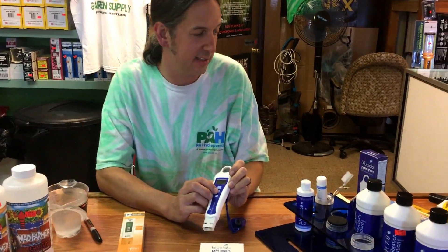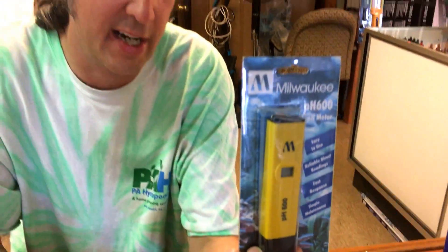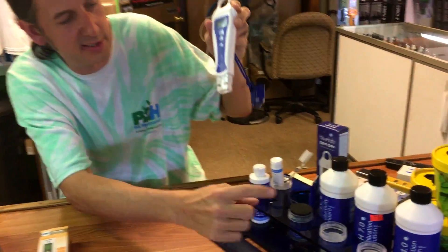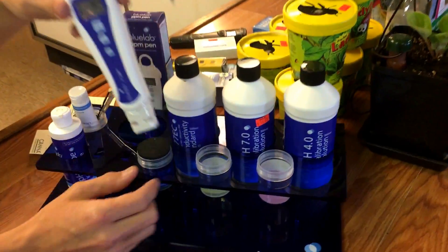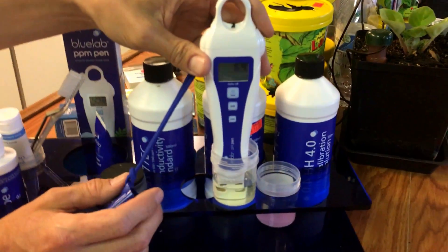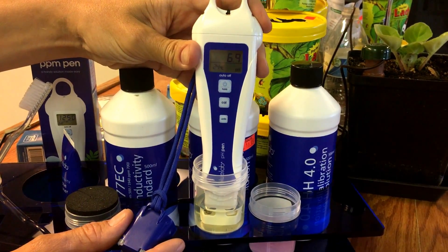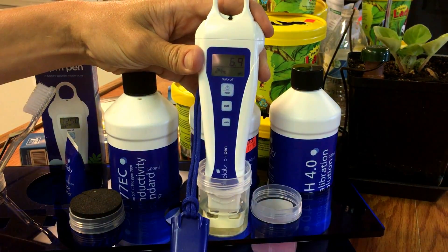Calibrating meters is pretty simple — most have a button that says calibrate. This little guy here actually has a screwdriver slot on the back with a small knob, which I call the old-school way. To check if the meter needs calibration, you set it in the 7.0 solution — make sure you have enough liquid to cover the probe — and swirl it around a little to make sure there are no air bubbles in the probe chamber. Right now we're reading 6.9, so it's off by one tenth of a point. We'll go ahead and hit the calibrate button.